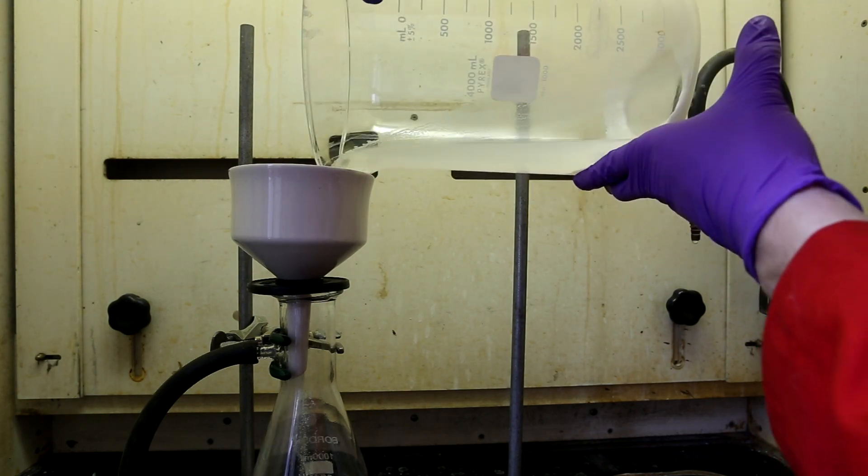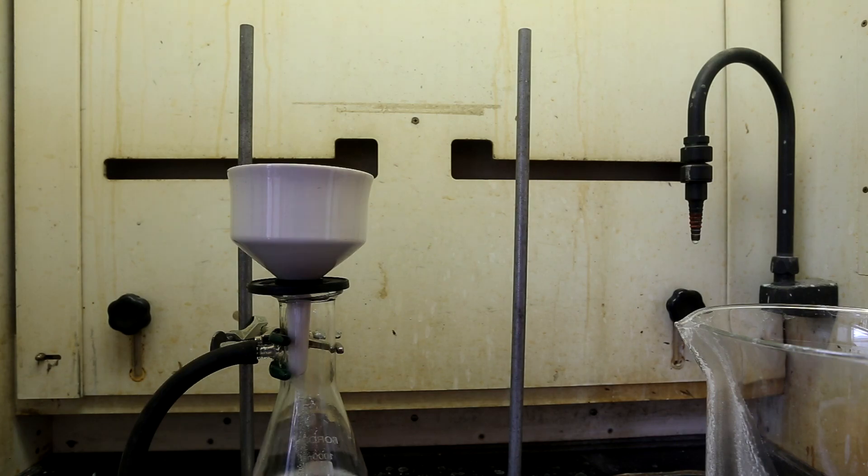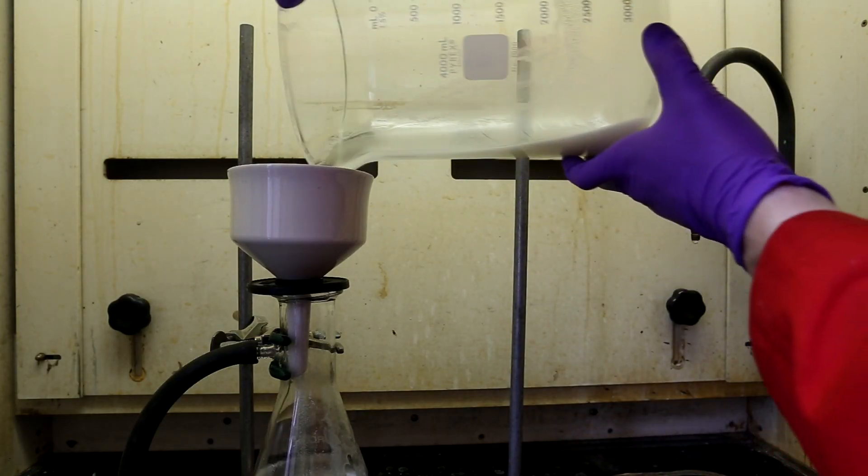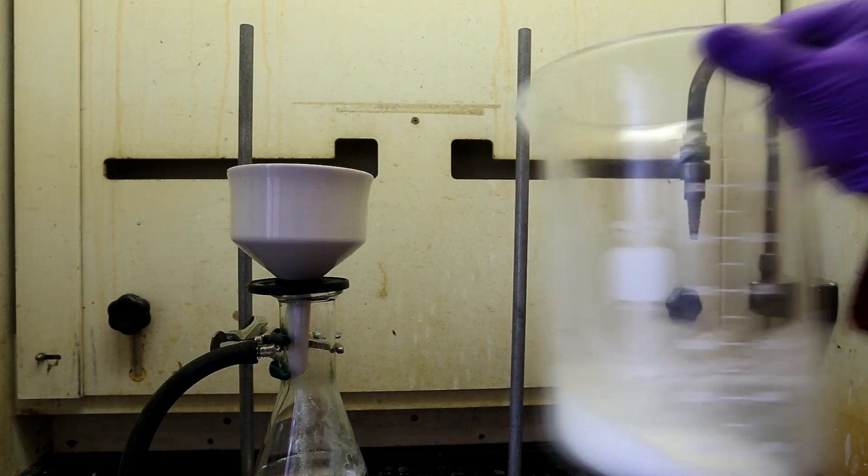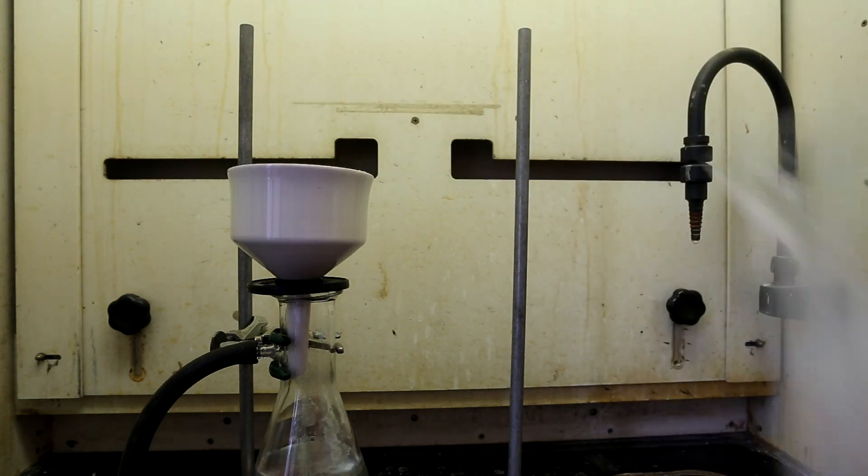Now, all that needs to be done is to evaporate the acetone to recover the acetylsalicylic acid. If you're at home, the best course of action is to transfer the solution to a large open top container and then let it sit in a well-ventilated area to evaporate off all the acetone.